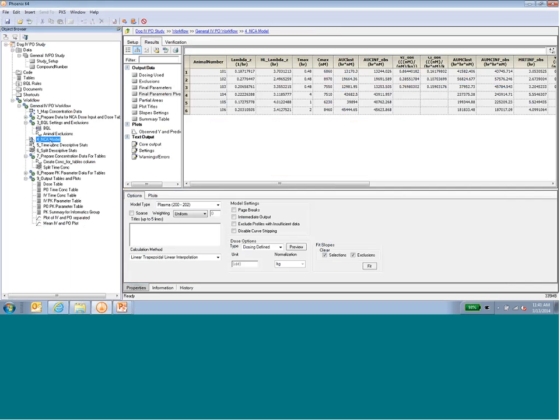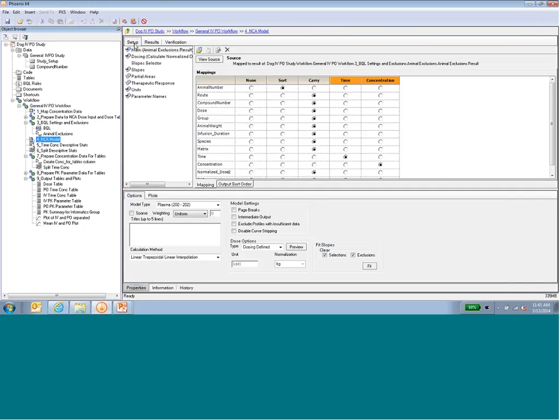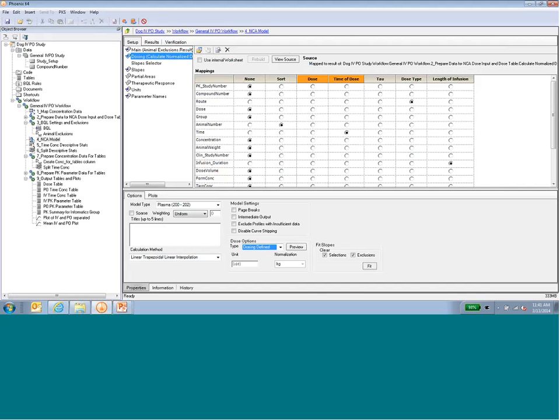And just highlighting what's new in this example, this is the non-compartmental analysis. And we see in the bottom panel here this dosing defined section. So what that allows you to do is you can go to the dosing setup, and then the dose type selection is governed by the route of administration.